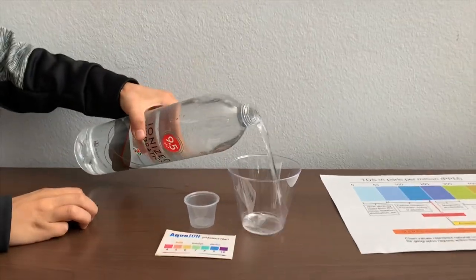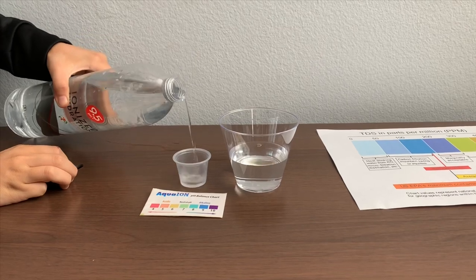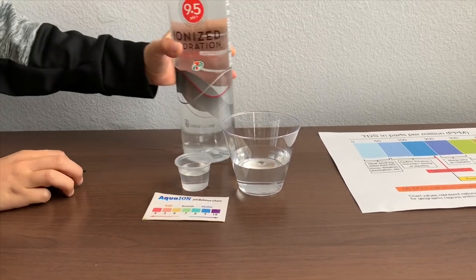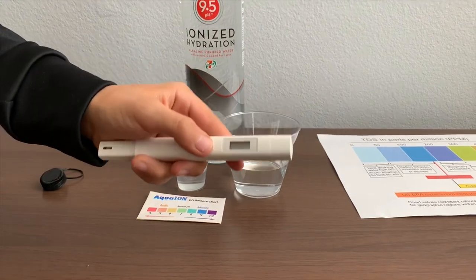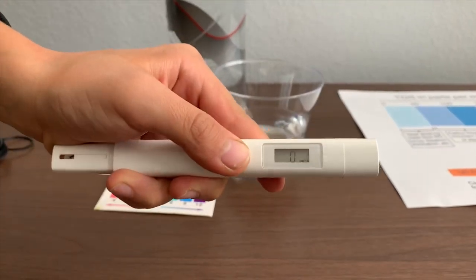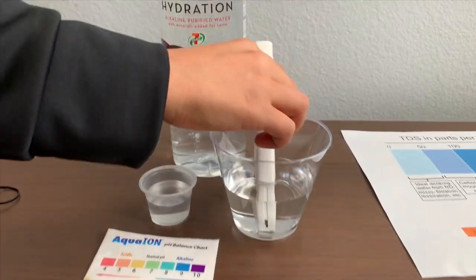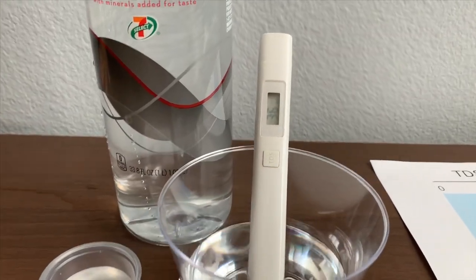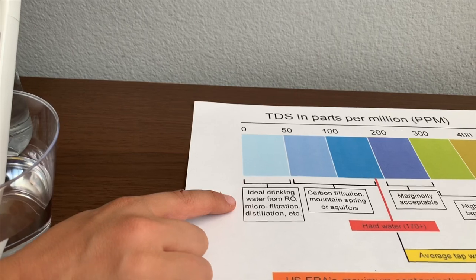Let's pour some water in. First, let's test the TDS level. If you want to buy this TDS tester, check the link down below. Turn on the TDS tester. Make sure it says zero and put it in. 36 — that is ideal drinking water.